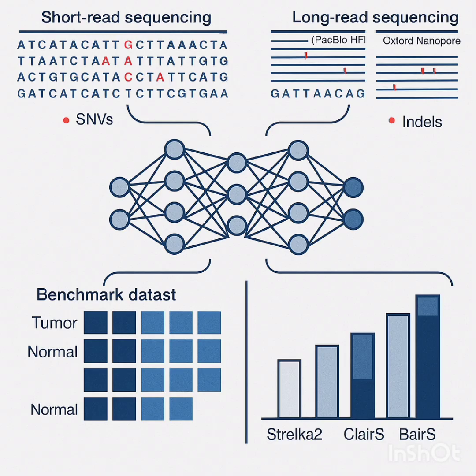Indels, those are always the tough ones, right? Because they shift the whole reading frame. Exactly. They mess up the alignment, making them harder to spot reliably. Let's look at some numbers from the HCC1395 line. For Illumina short read indels, DeepSomatic gets an F1 score of about 0.89 compared to Strelka2 around 0.79. That's a good improvement.